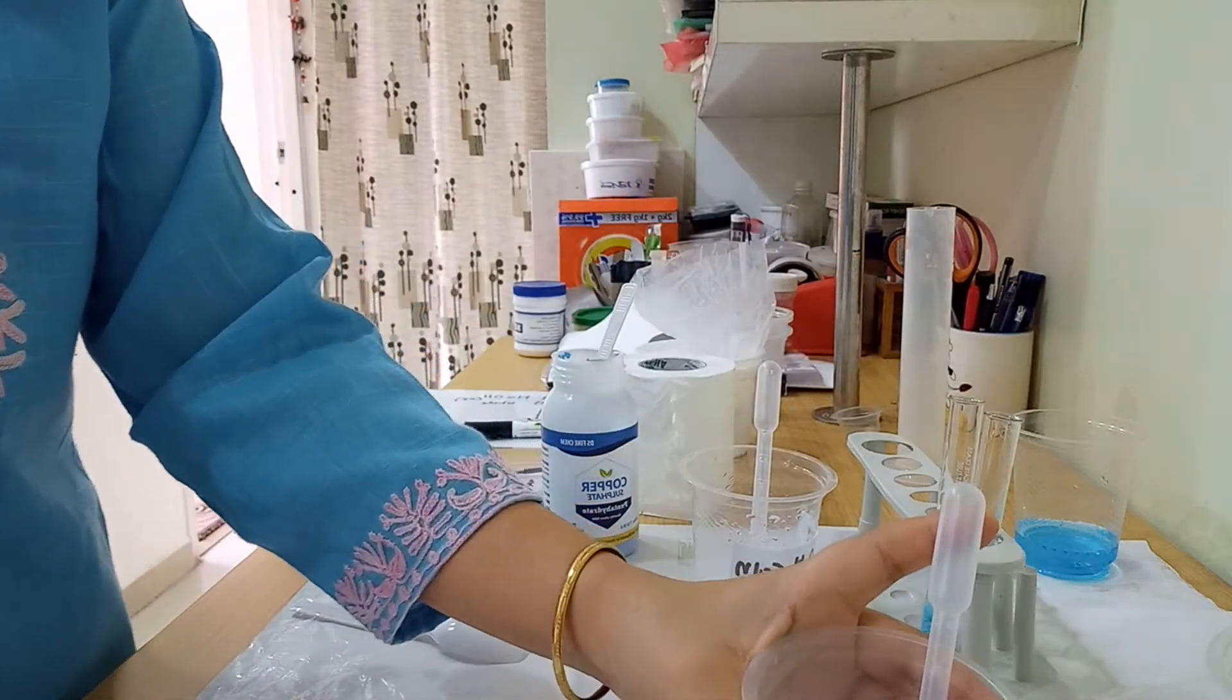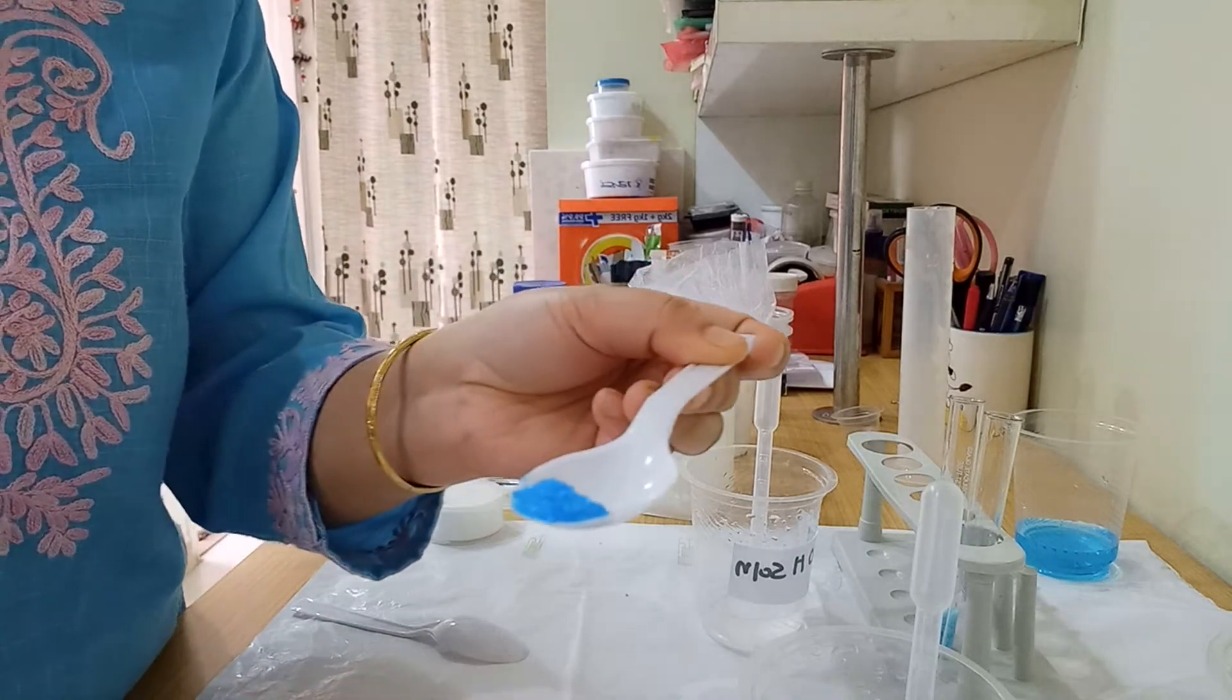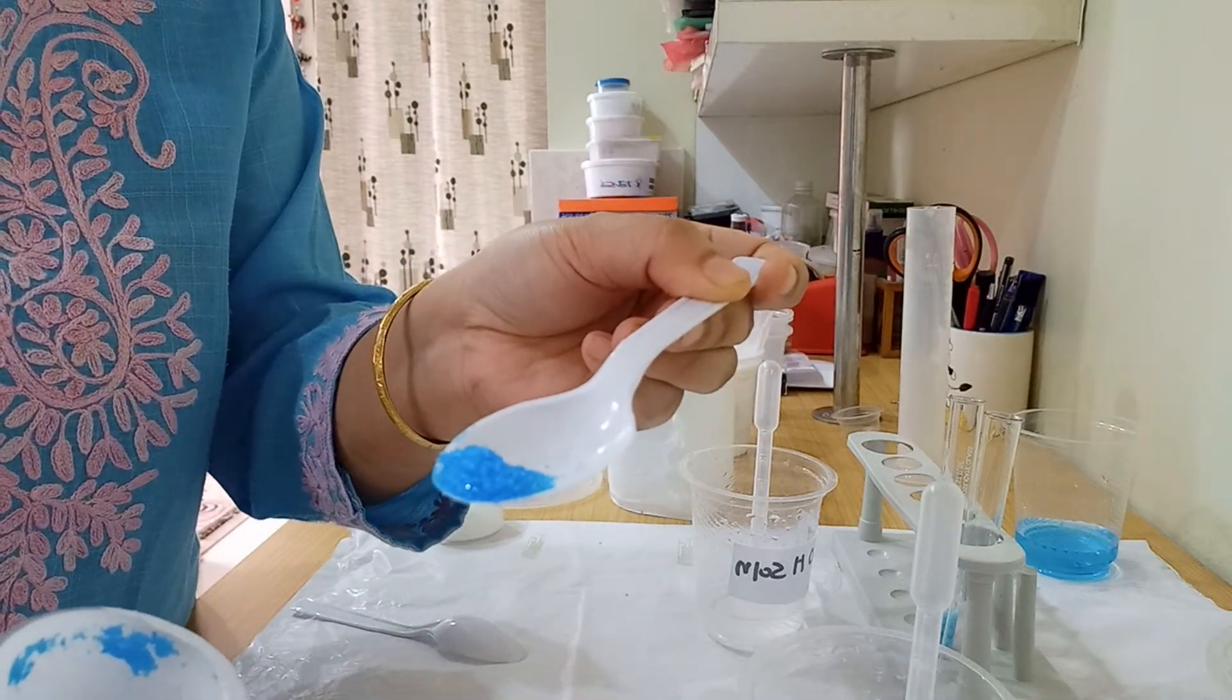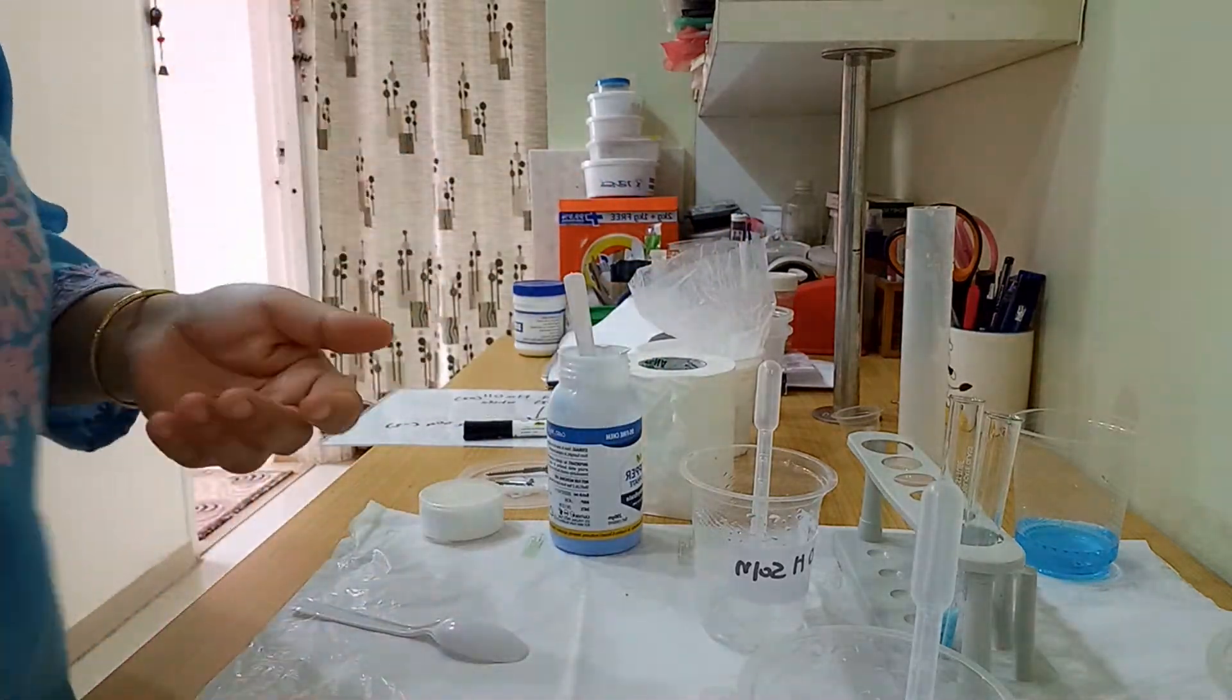I can show you how the copper sulfate looks. You can see here the copper sulfate is a blue crystalline solid. Now I'm going to show you a simple experiment.